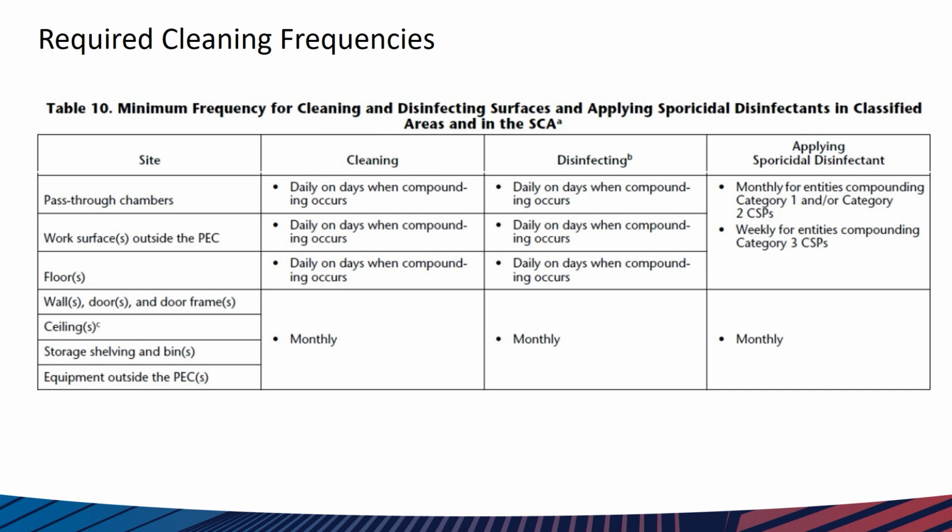I think this question is going to be more geared towards Abby, but say if we want to validate our cleaning processes with surface sampling, some of us are hesitant because that might take our room down. So say if you want to validate EVS cleaning and take a wall sample, how would we approach that if it was actionable and not taking a room down? That definitely sounds like an Abby.